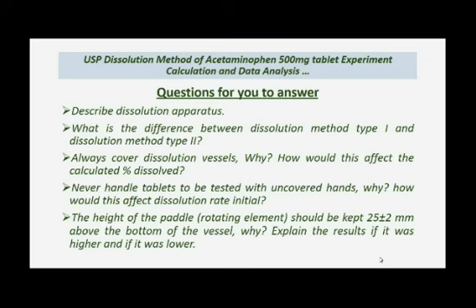Never handle tablets to be tested with uncovered hands. This should be done to avoid transferring lipid secretions or a product that may cover your hands to the tablet. This will cause the formation of a barrier layer that will limit the wetting of the tablet, which will affect the disintegration and dissolution.